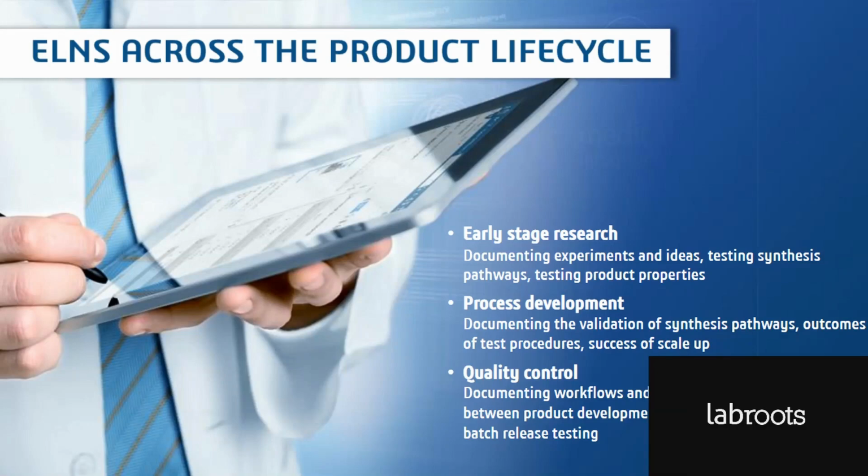And so you could see how it'd be useful to break down the barriers and purpose-built nature of some ELNs and to have something that's more flexible and can be used across the product development spectrum rather than siloed in each area. And that way, you get to preserve the data in its original format and tie the whole project together as the product moves to market.